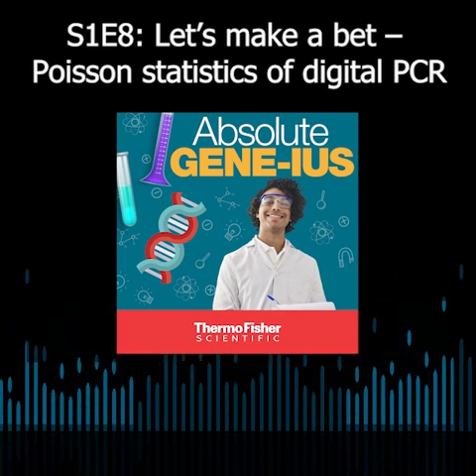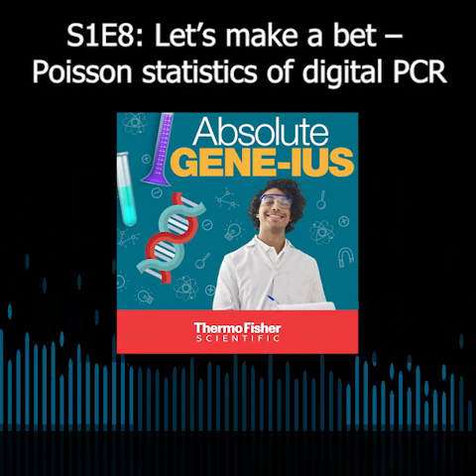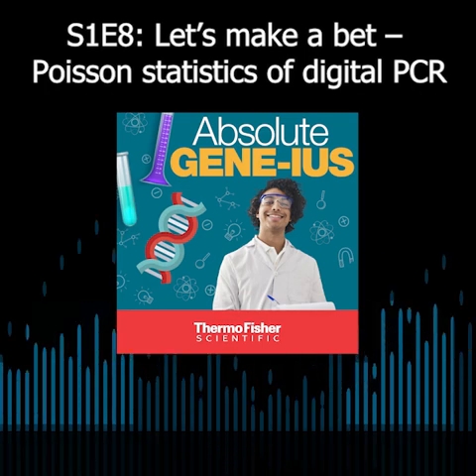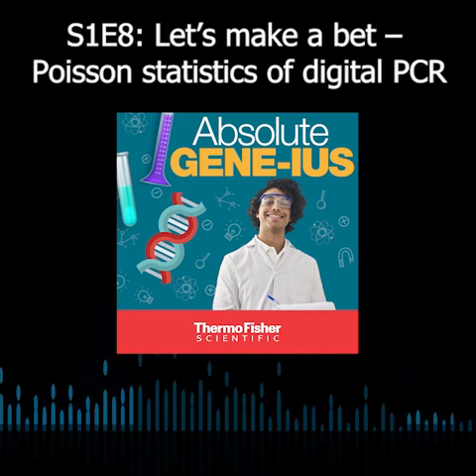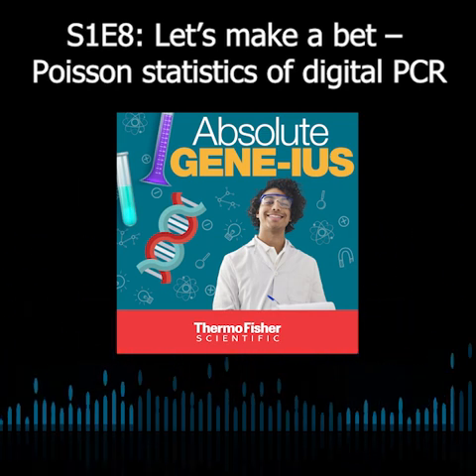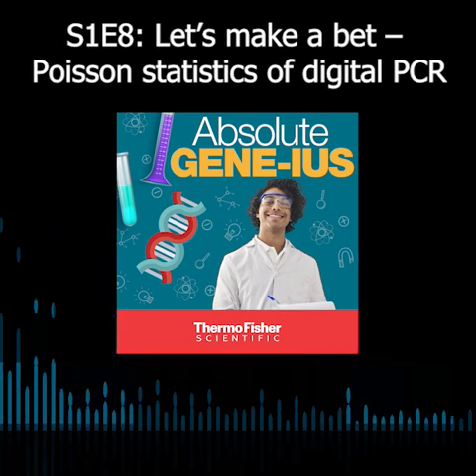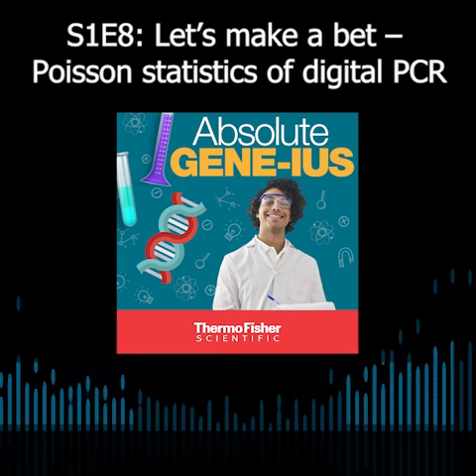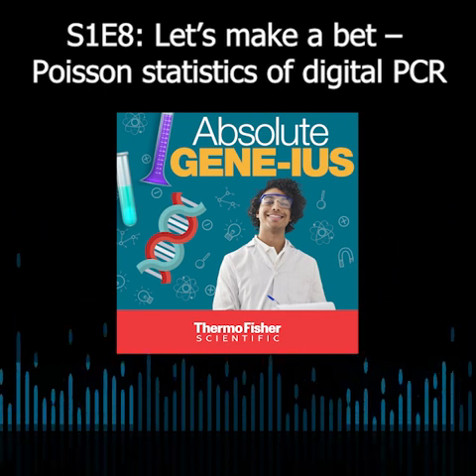Very interesting. So I know talking about liquid biopsies and some of these cancer biomarkers, NGS, next generation sequencing, is used frequently in this research and these studies. Is there a way that digital PCR complements or can be used in conjunction with next generation sequencing techniques?